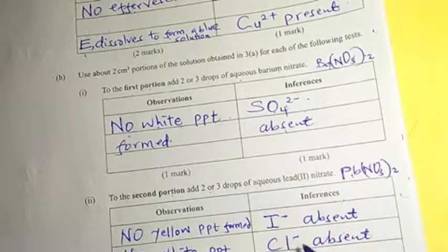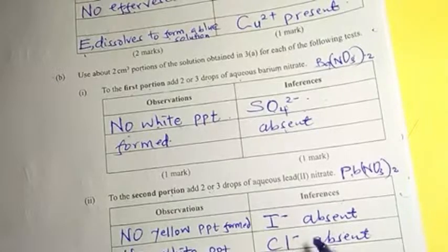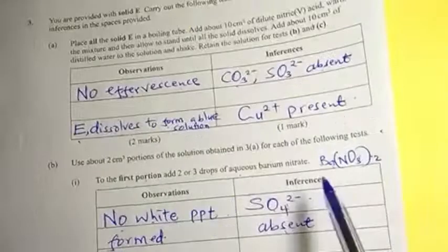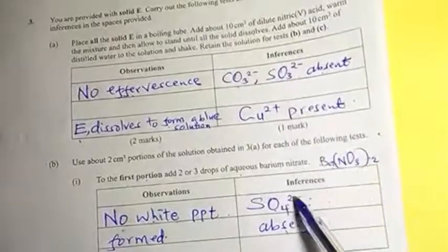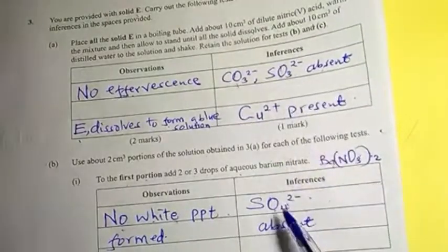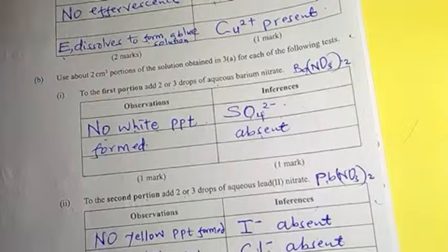Now the question is, why didn't I say the sulfate, the sulfite, and the carbonate? It is because from the above experiments, we have already said that the carbonate, the sulfite, and the sulfate are not there. Therefore, we are not going to repeat ourselves. We only include the anion or the cation that we have not mentioned. Therefore, this means this chloride is absent.